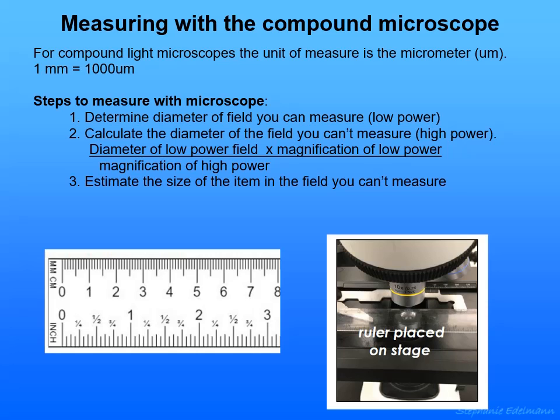So I put a ruler there to try to help you remember what a centimeter is, so that you can have an idea of what a micrometer is in relation to the rest of these measurements. You see the ruler, and the bottom scale is inches. You see 1, 2, 3 inches on this ruler. On the top, each of the numbers reflects a centimeter.